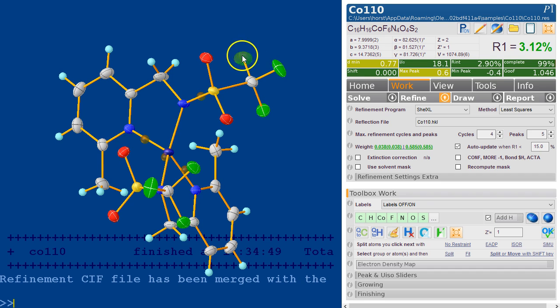Again, this is a very artificial example. If you wanted this to be in part one, what you need to do is select the atoms and type part one. That's it. It's putting it into part one. So there is no need to edit the files in any way.